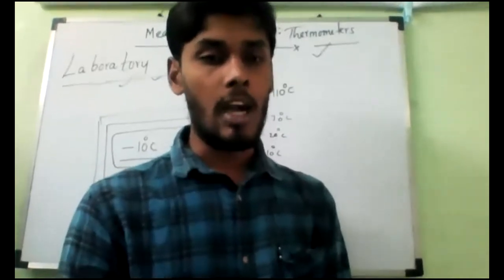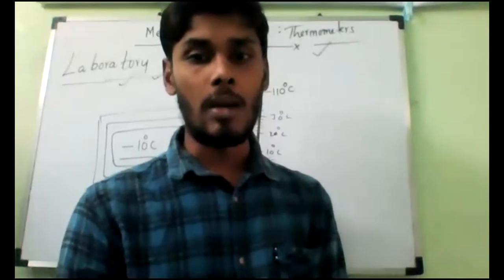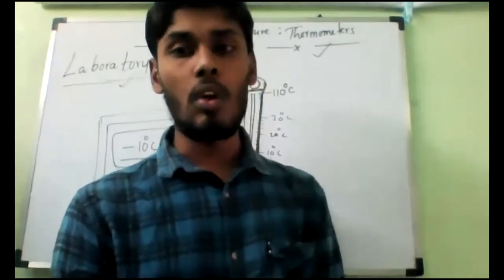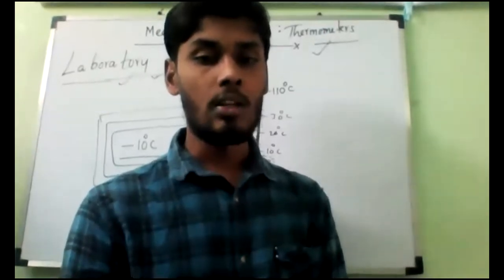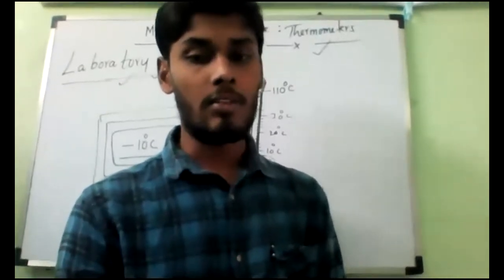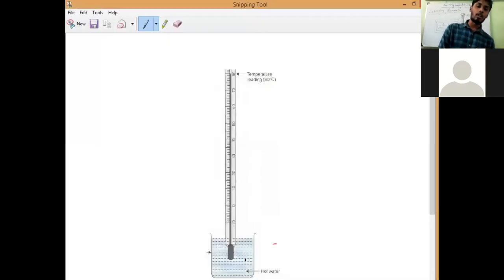Not 100, normally hot water. I'm keeping it and observing. Now you tell me, you must measure it and count it, and what is the temperature present in that picture. In this picture, I am measuring the temperature of this boiling water or else hot water, so you can observe here the mercury level is rising, and here, till what point are you observing?